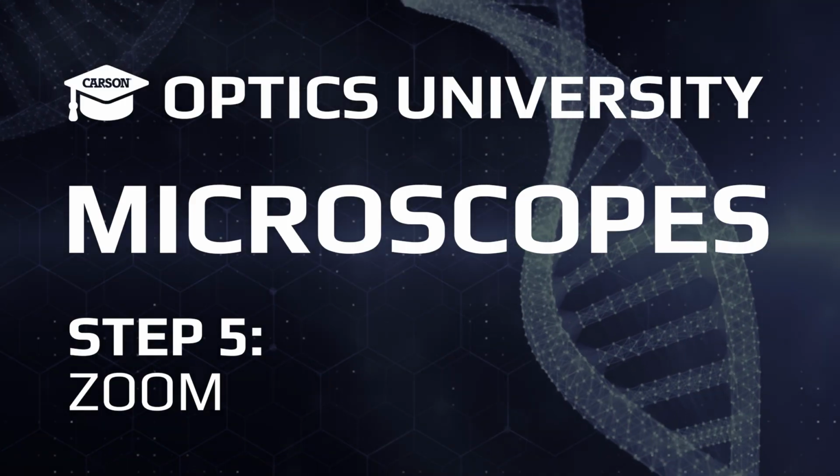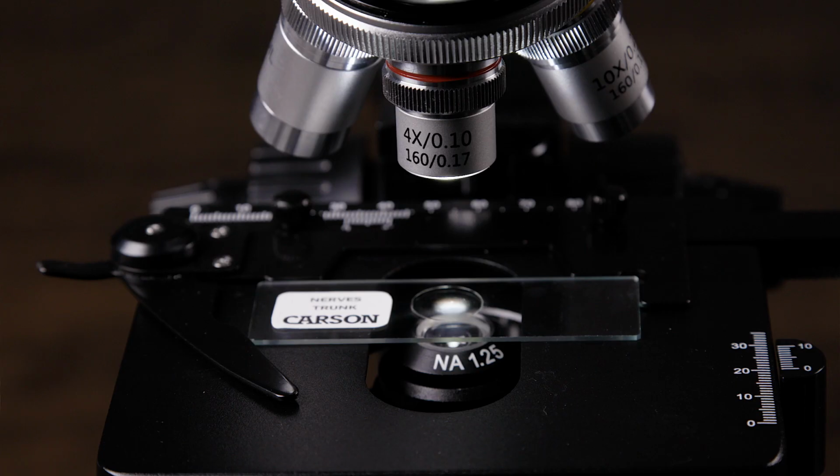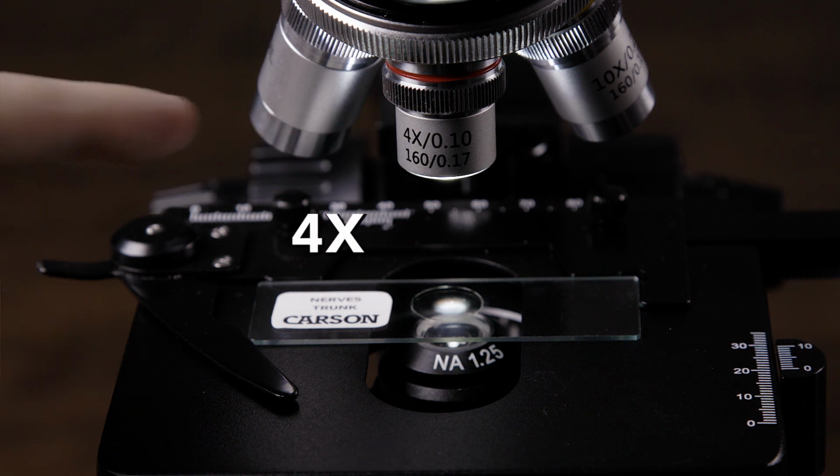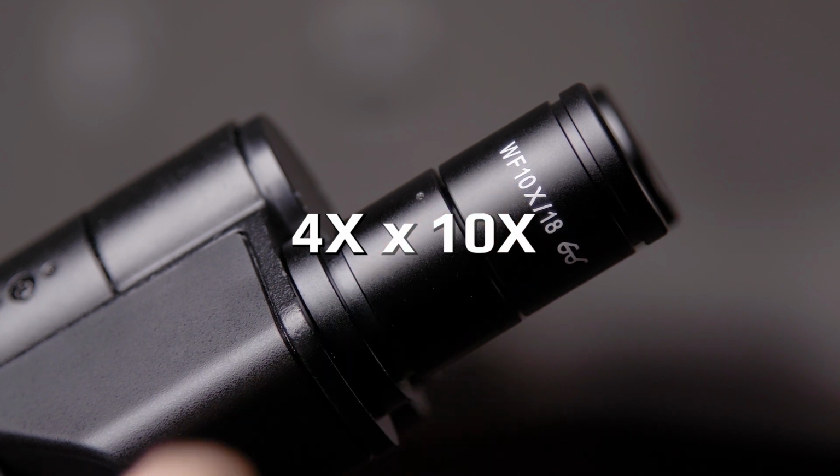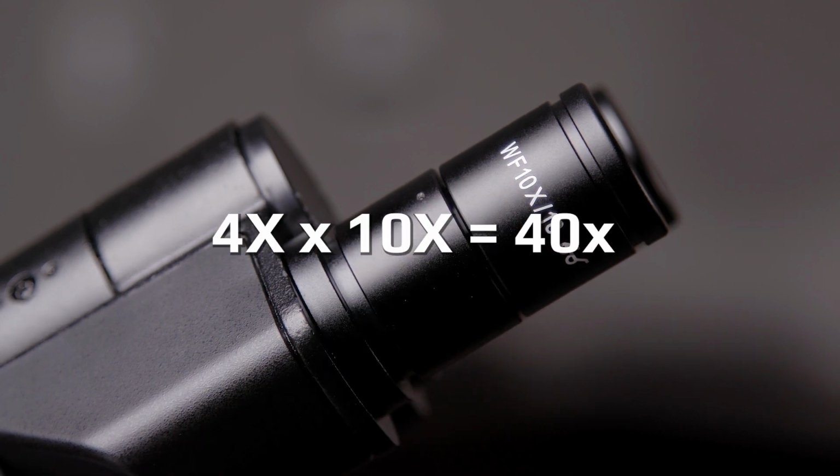Step 5. Zoom. To calculate the magnification, you can multiply the power of the objective by the magnification of the eyepiece to get the total magnification.